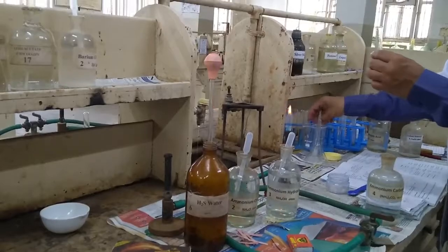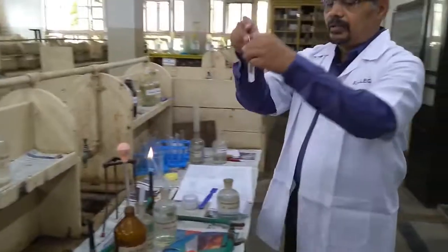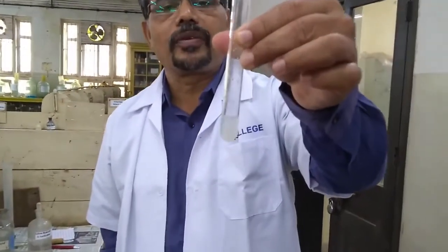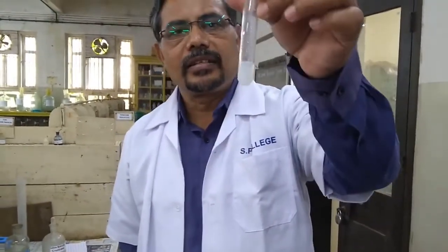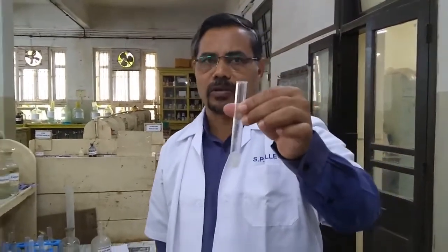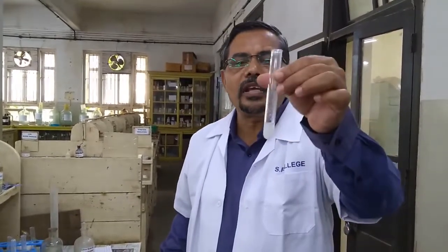Then it gives the gelatinous white precipitate formation. So this indicates the presence of group 3A in the given mixture. So we have detected the presence of group 3A and group 6 in the given mixture.